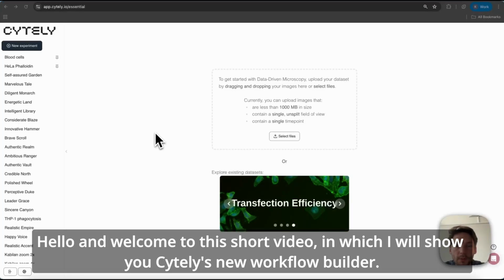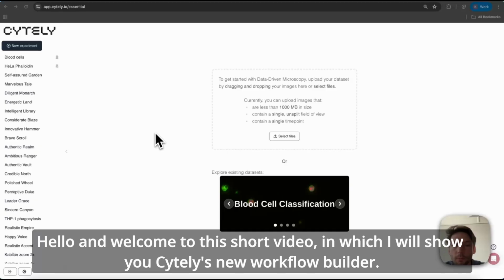Hello and welcome to this short video in which I will show you Cytely's new workflow builder.